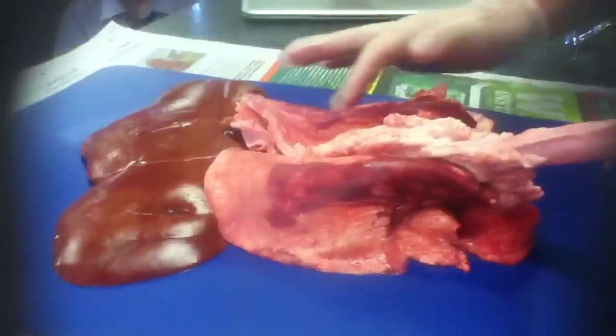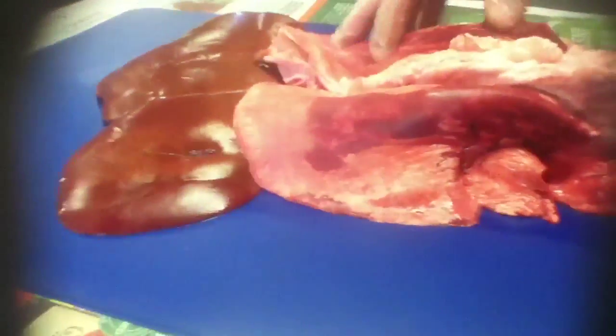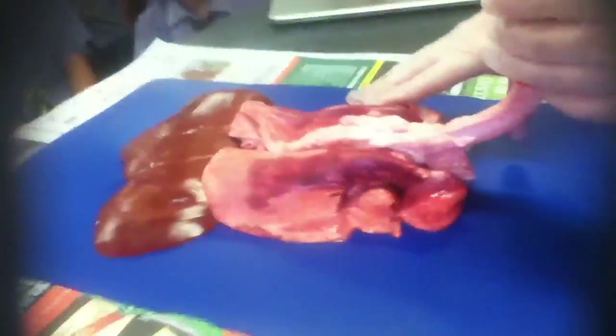Now, these lungs don't look like much, but you can see it's red. This is all our capillaries, our blood vessels going through here, and that's the blood that's left over that's still there. You can see they look very red. So right now these are totally deflated, so what I'm going to do is attempt to inflate these.